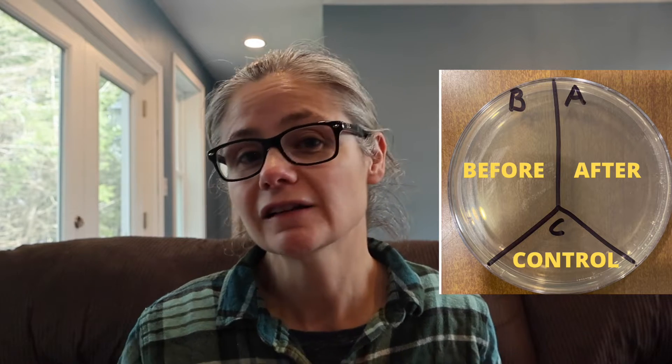In order to test how well this Tide Antibacterial Fabric Spray works, I am going to take a Petri dish like this guy here and label it A, B, and C. I am going to take some sterile swabs and swab various areas around my home. I will probably swab some soft surfaces like a couch and place that sample on the section labeled B for before.